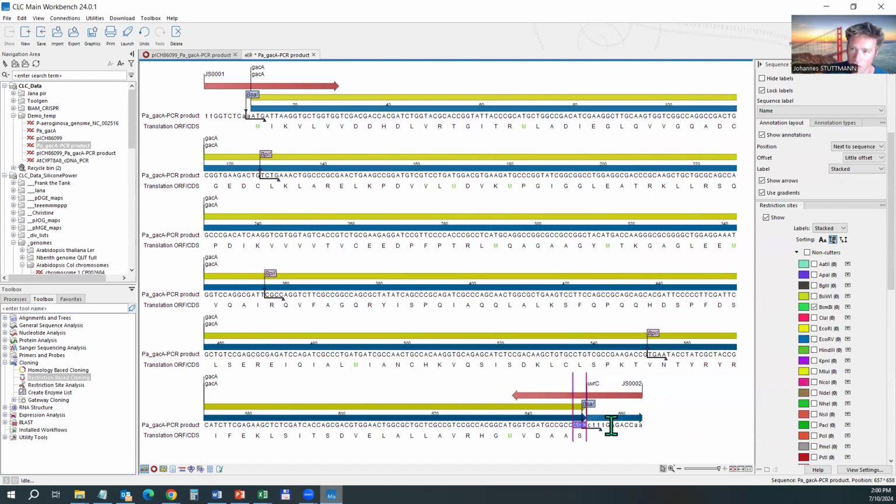And I said I want a serine alanine linker. Since there is a serine at the very end, this is maybe a bit weird, but let's still put the full sequence. So I would need 2 codons coding for serine following this AGC codon.